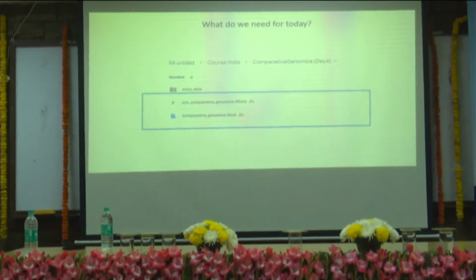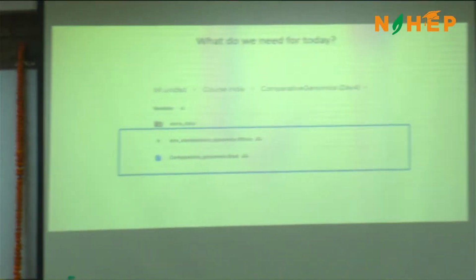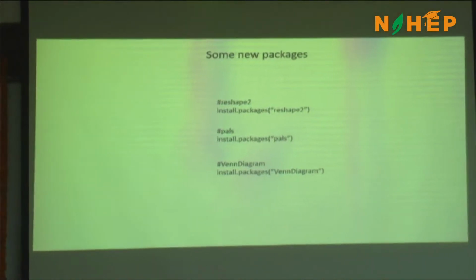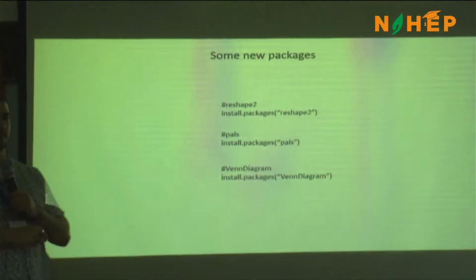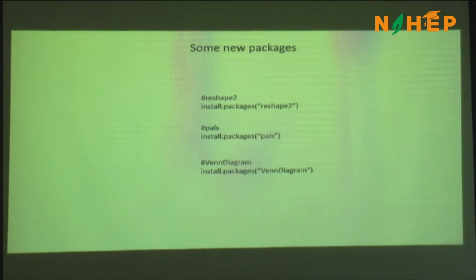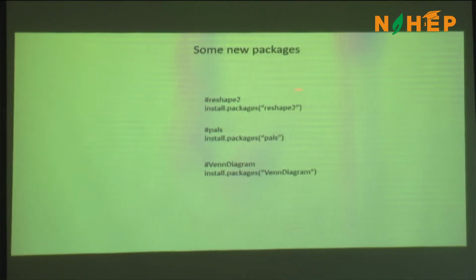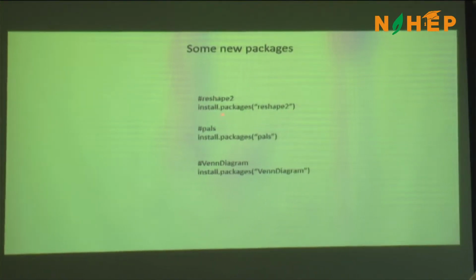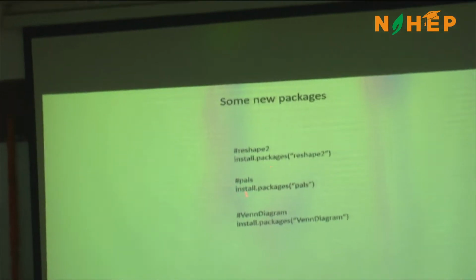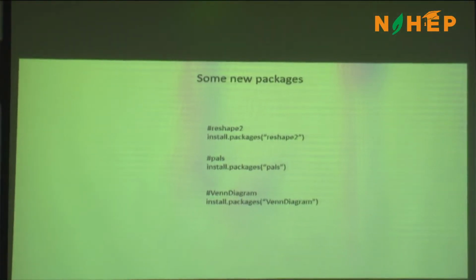This is the material that we had to download, so I hope all of you downloaded already. Yes? Thumbs up? Okay, good. So we need to install 3 little packages, but now all of you are experts, so it should be really easy. So you just need to write it. First, you write this one, reshape2. So install.packages, reshape2, and then the same with the other 2, one by one, only please.